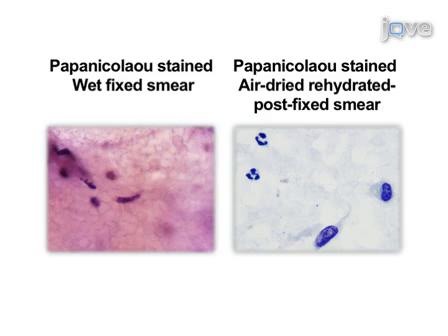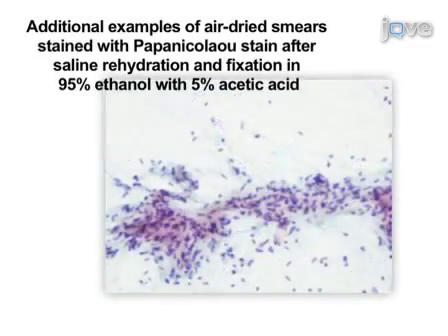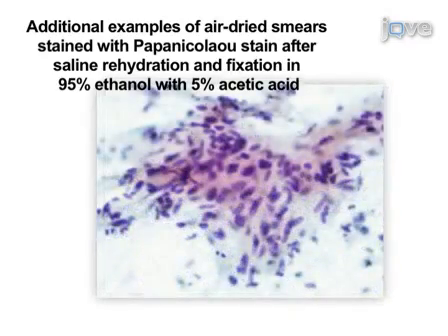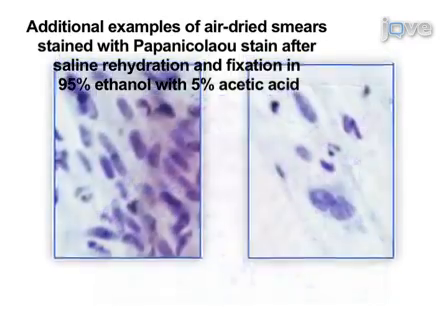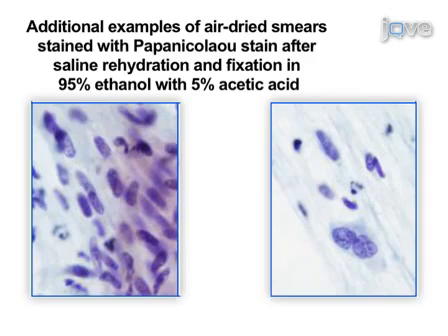Analysis of these initial stains will determine additional tests you may want to perform, such as elective cell block, electron microscopy, microbiology cultures, or others. Successful completion of phantom lesion will allow proper aspiration of lesion material, in this case pasty vegetable material from banana. This material can be spread on the glass slides to practice smearing and staining.